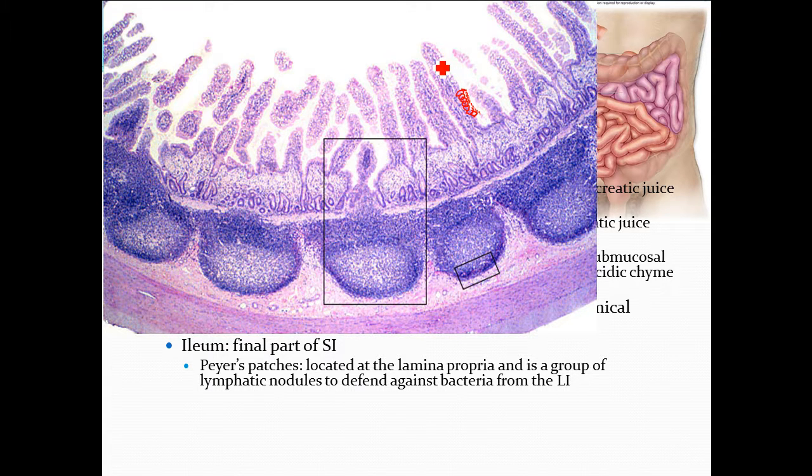Okay, good. And if we're talking about what's inside here, what is inside here? Okay, it's part of the mucosa.